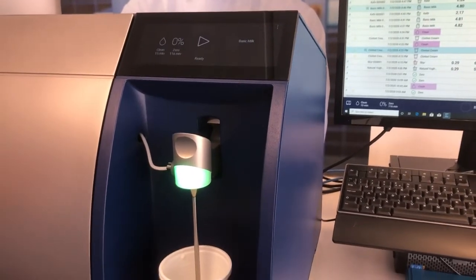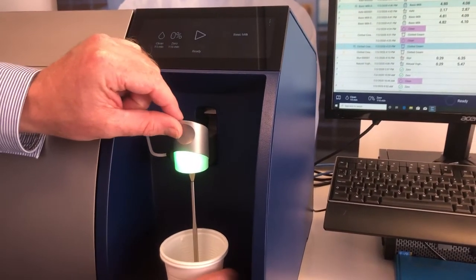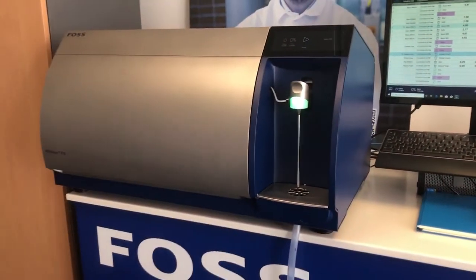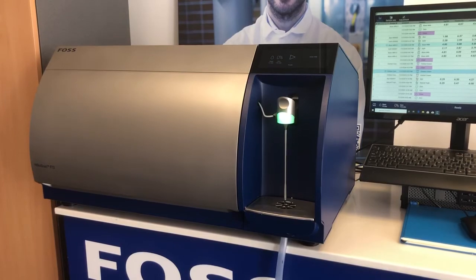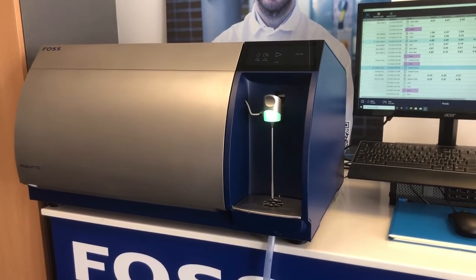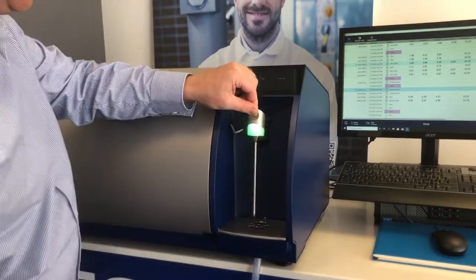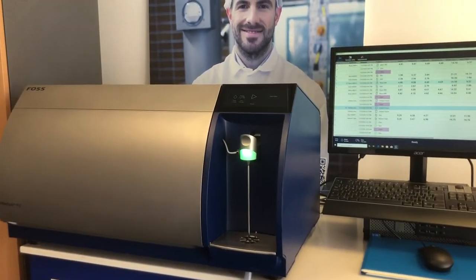As we can see, the milk sample has finished analysis. The pipette has turned green so we lift the pipette, take off the sample, and wipe the pipette as you do with your existing milk analyser.